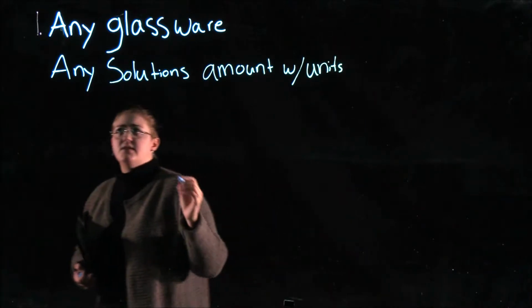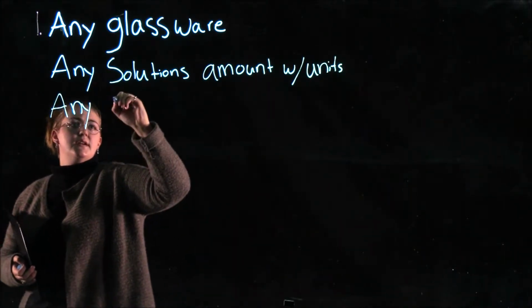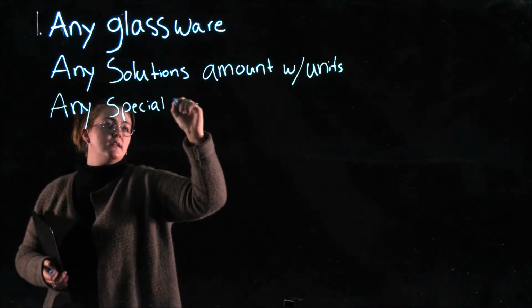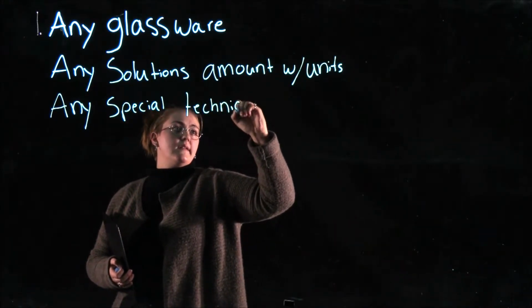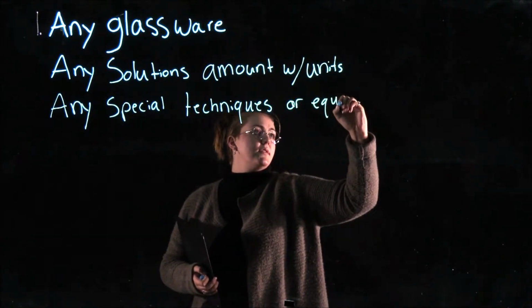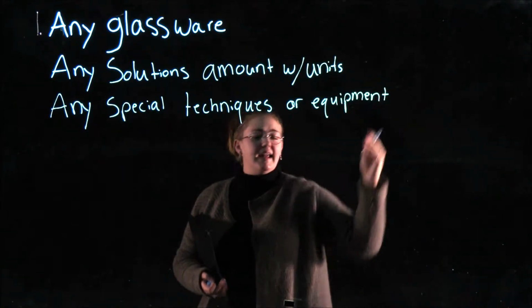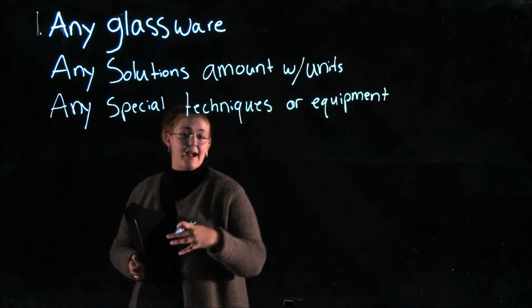And finally, you want to include any special techniques or equipment you're going to use. And again, we're just looking at your summary of procedures so we know that you are coming to lab prepared.